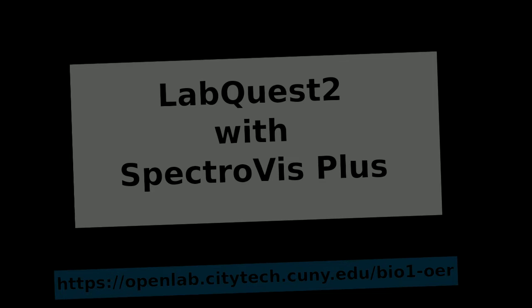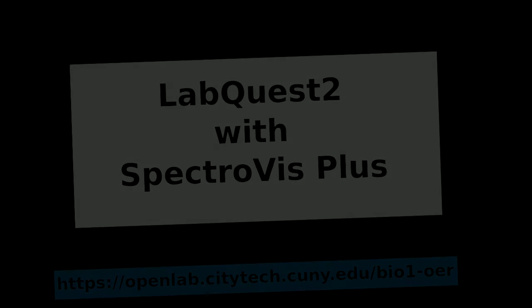This video illustrates how to set up the LabQuest 2 with the SpectroVis Plus spectrophotometer. First, ensure that the SpectroVis Plus is connected to the LabQuest 2 by the USB.